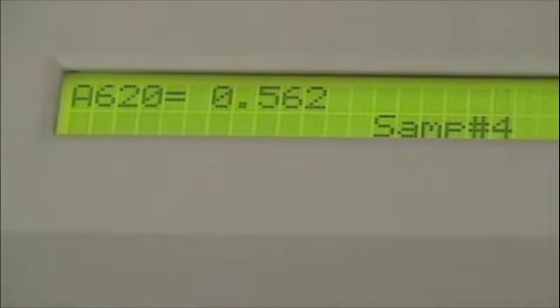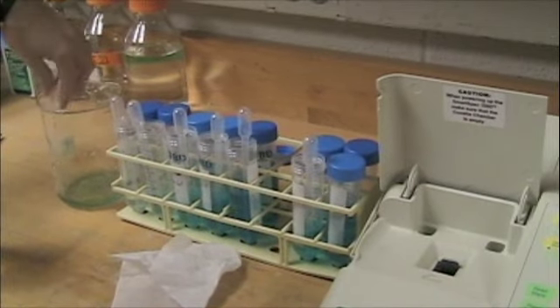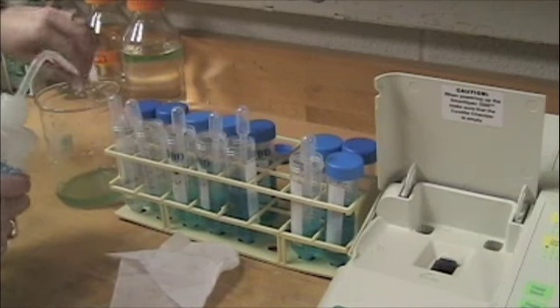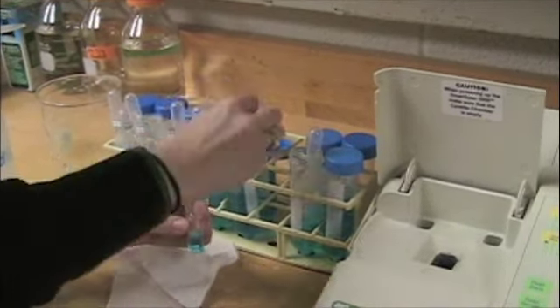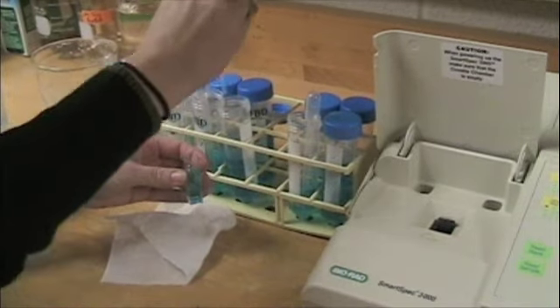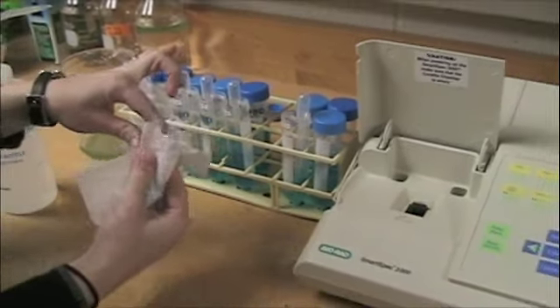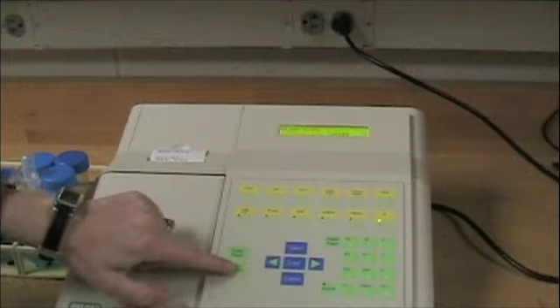Now we have one more sample to read. This will be our most concentrated. Into the holder, close the door, read sample, and here is the absorbance of sample number 5.